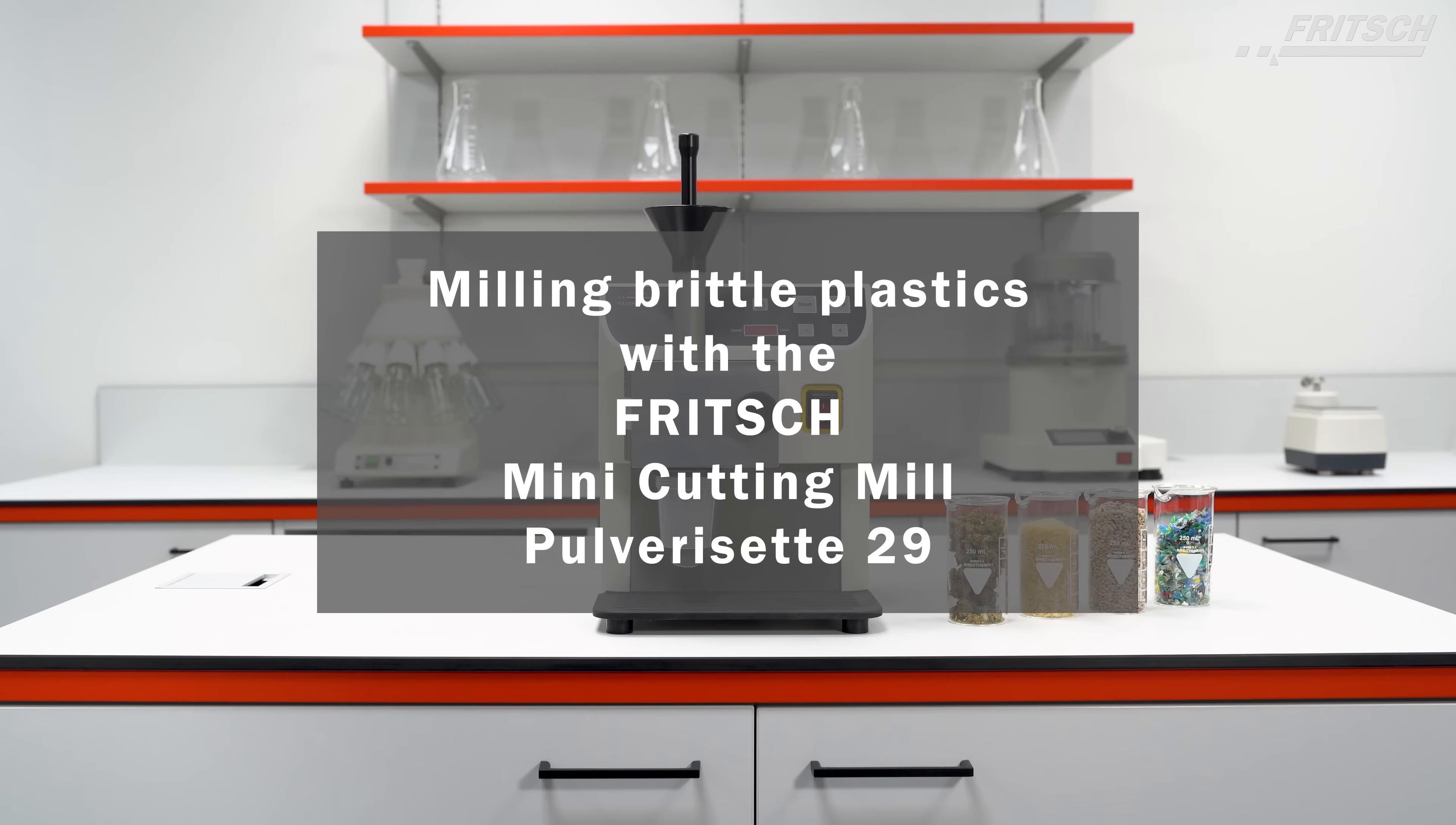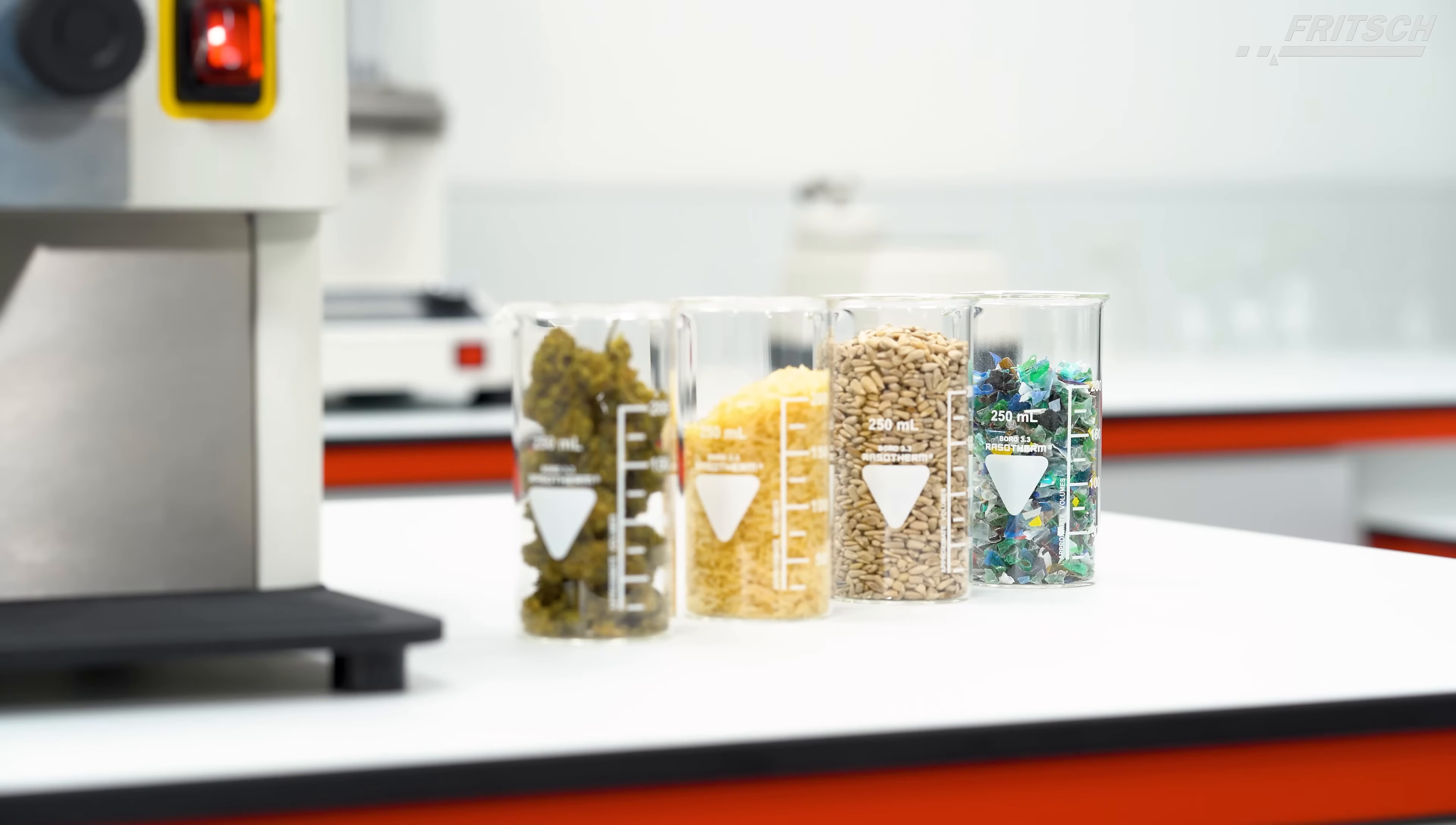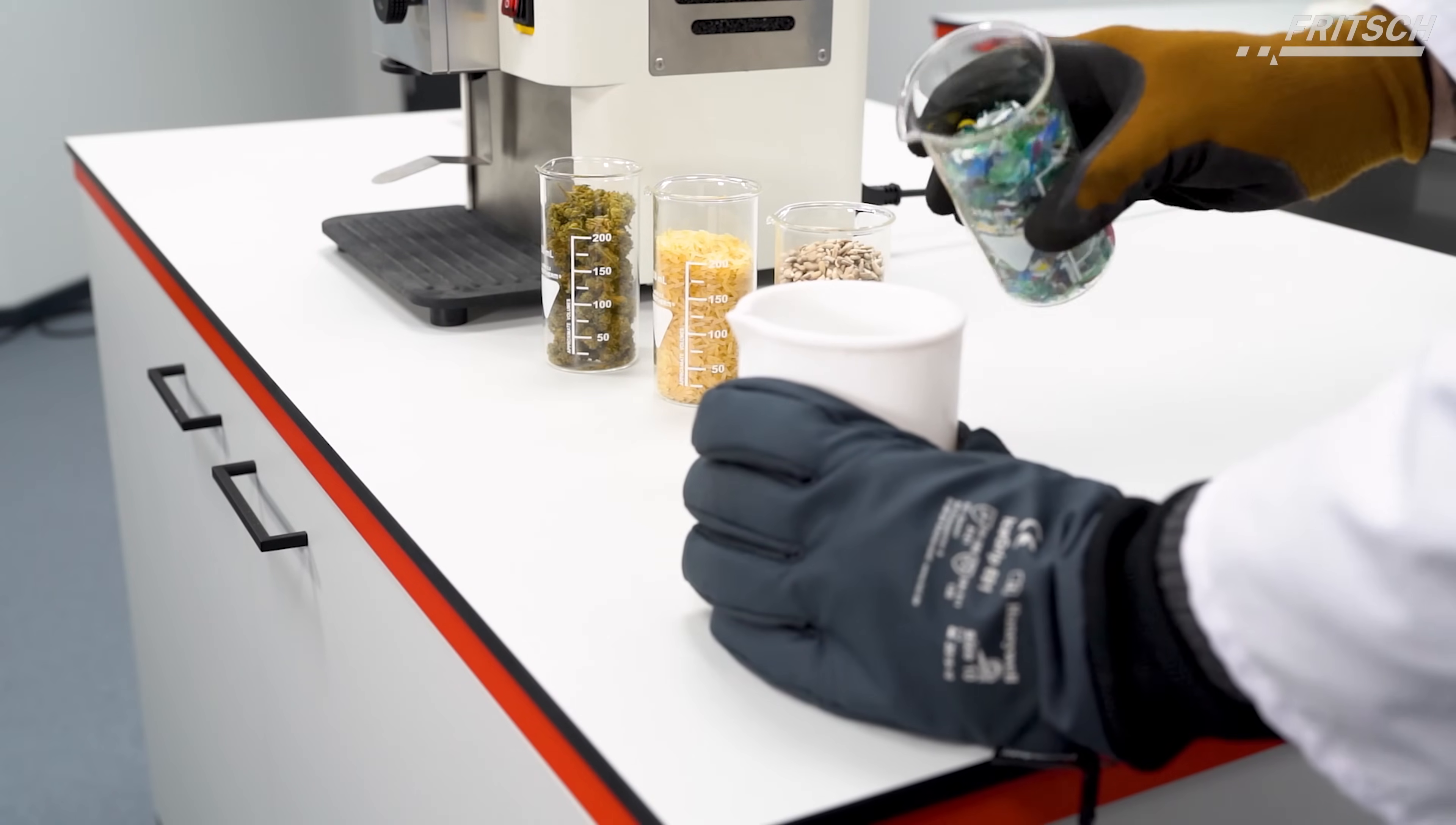The Strong and Compact Mini-Cutting Mill Pulverisette 29 by Fritsch. In this application video, we will guide you through the process of milling brittle plastic with the P29.